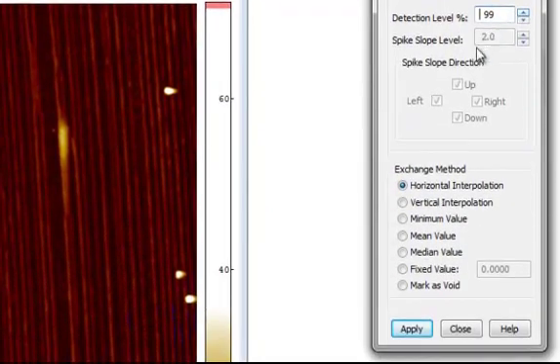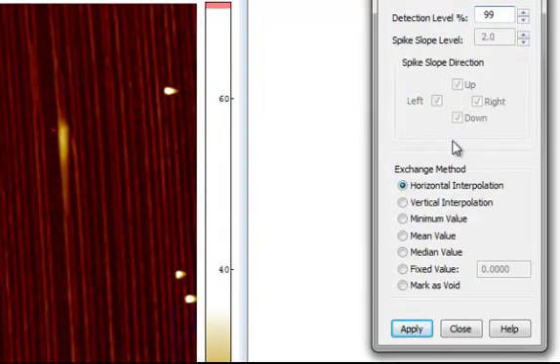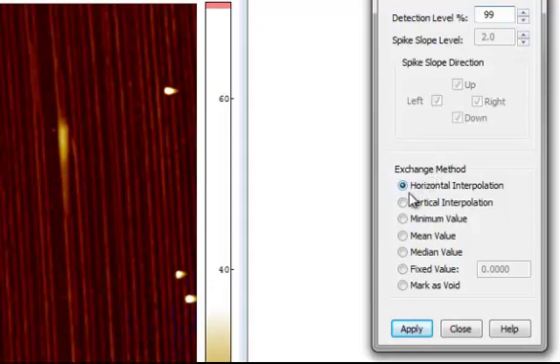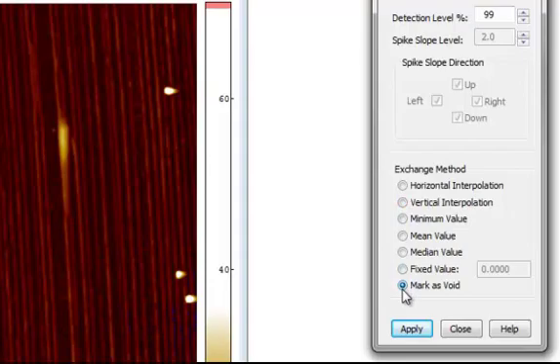Now we must select the exchange method. That is, how to generate new values when the particles are removed. Since this surface exhibits vertical structures, we'll select Vertical Interpolation. You can always choose to mark the areas as void if none of the other options are suitable for your surface.